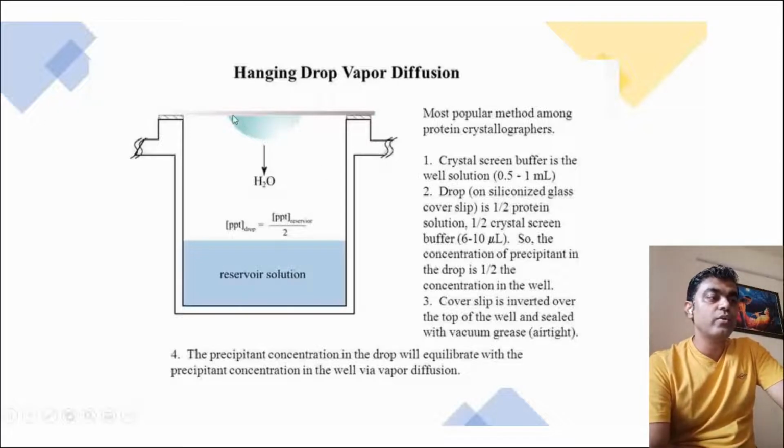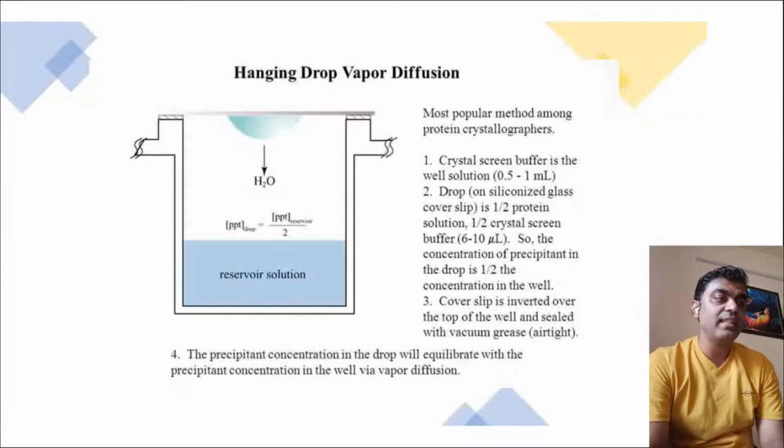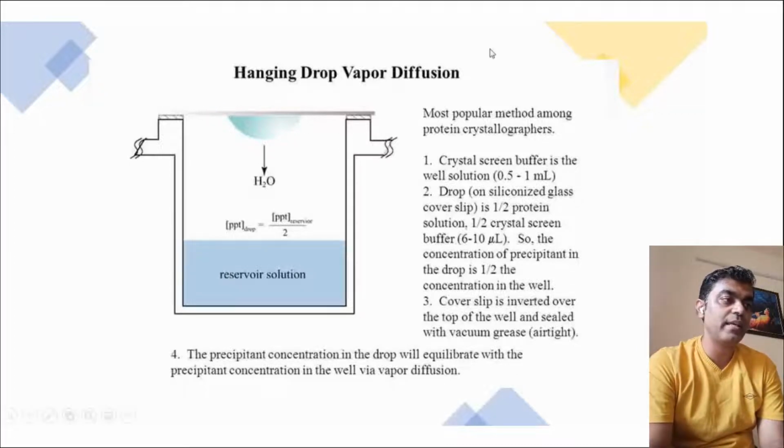So the resultant drop volume will be 6 plus 6, 12 microliter.